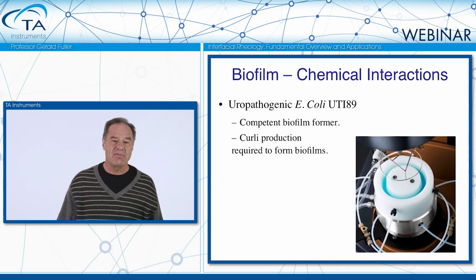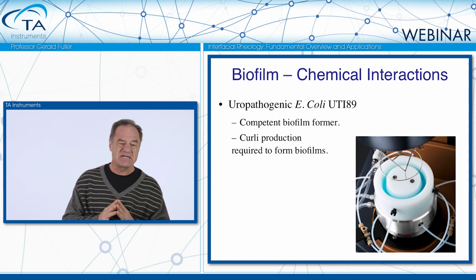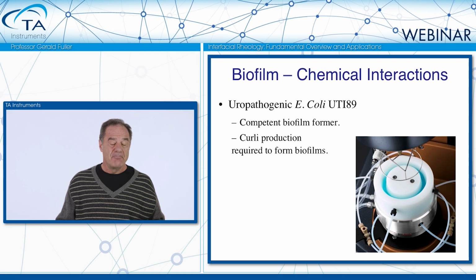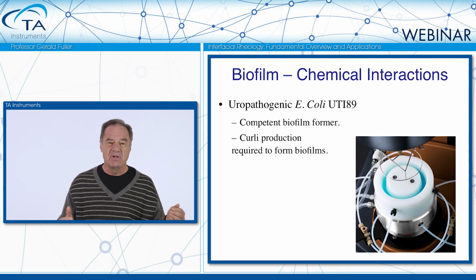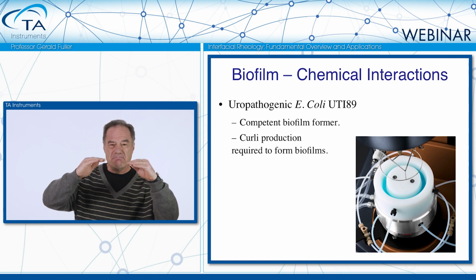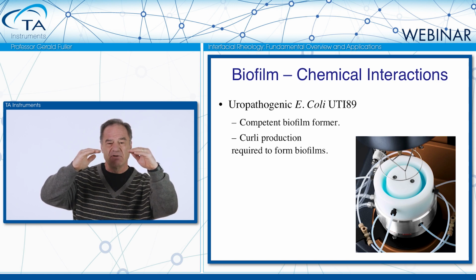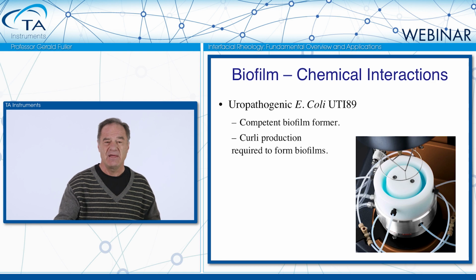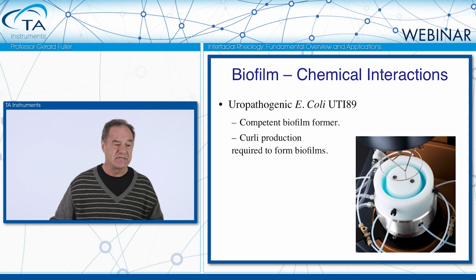Now, the nice thing about this attachment is it allows you to do some chemistry. This attachment is sold with the ability to pump liquid in and out of the cup and maintain the level fixed at the position of the ring. So you can do chemistry. So you can bring in a molecule that might interact with your interface, and you can track that very nicely.